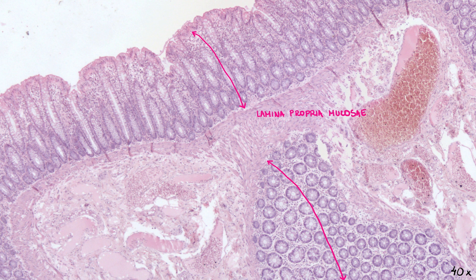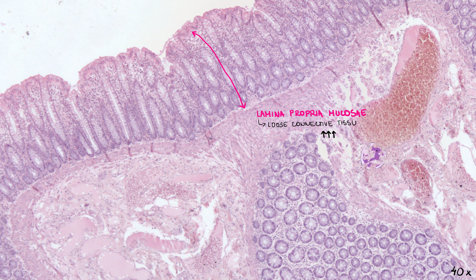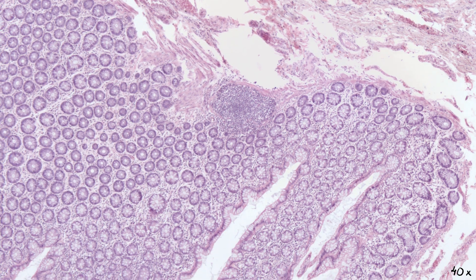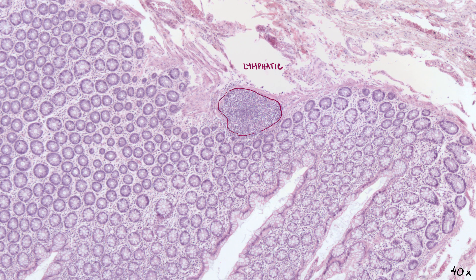Lamina propria is a layer of loose connective tissue. There is an abundance of cells in this layer — not only fibroblasts and other connective tissue-related cells, but also lymphocytes. From time to time, we can see lymphatic nodules which even reach the submucosa. The presence of lymphocytes is a reaction to the great number of bacteria present within the large intestine.